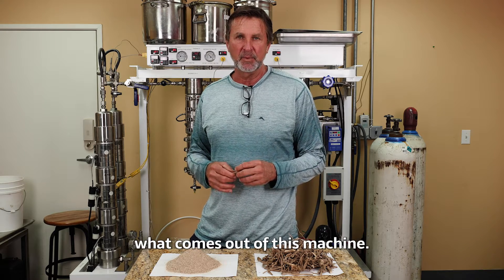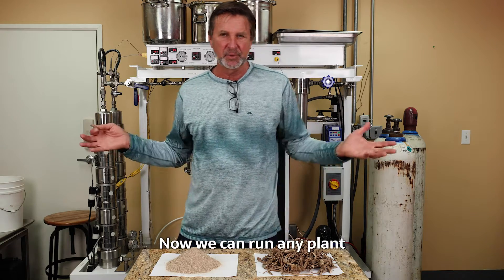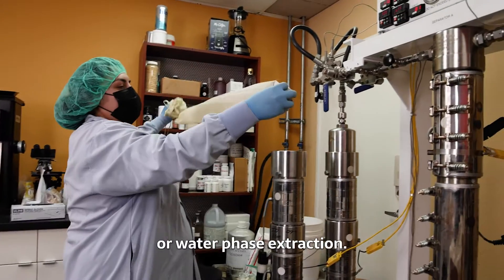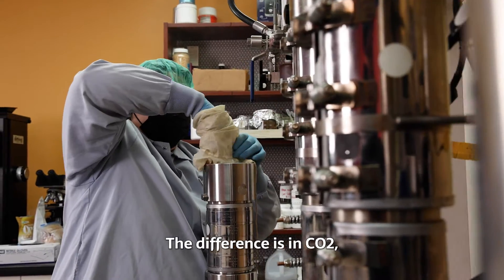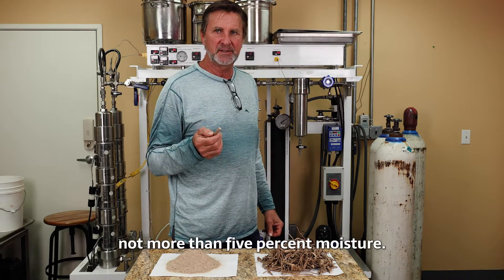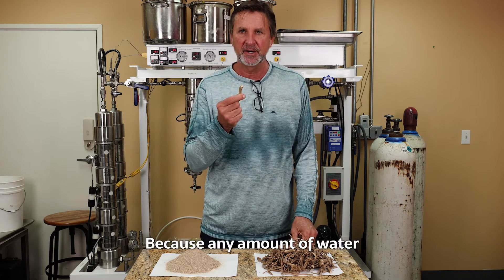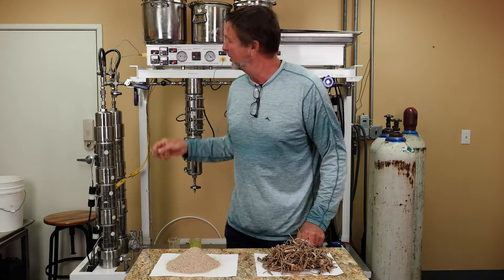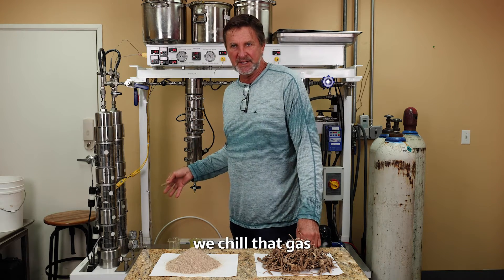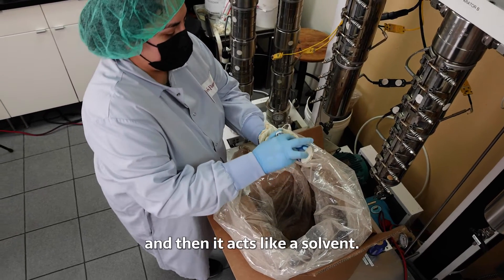You'll see in a minute what comes out of this machine — it's really incredible. We can run any plant material in CO2 extracting, just like you can in an alcohol or water phase extraction. The difference is, in CO2, it has to be absolutely as dry as we can get it. We like to get down to three, not more than five percent moisture. Because any amount of water inside this root — the CO2 is in a liquid form. We start out with a gas, we chill that gas and put it under intense pressure, get it into a liquid, and then it acts like a solvent.